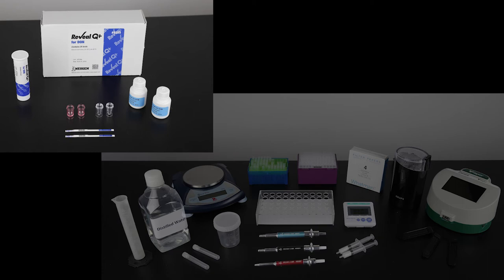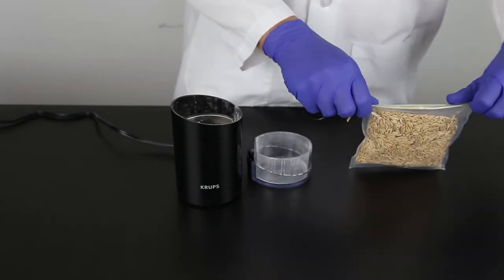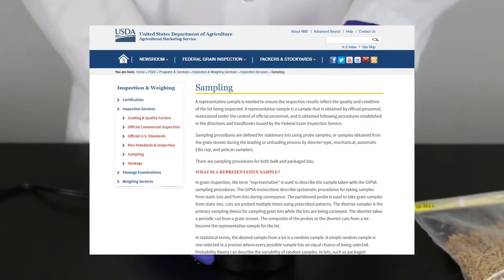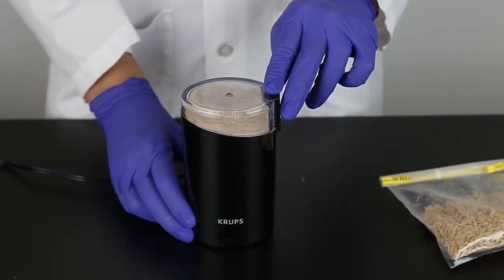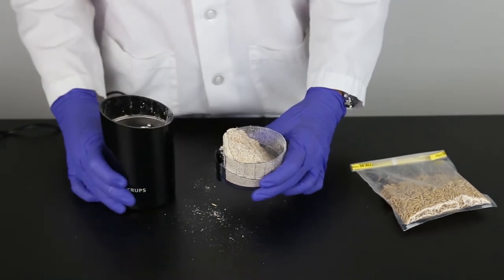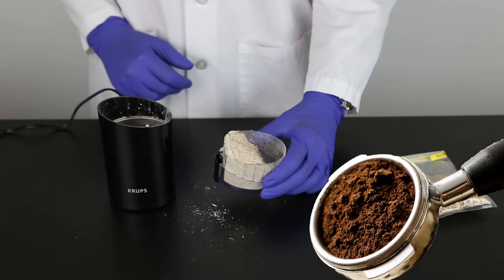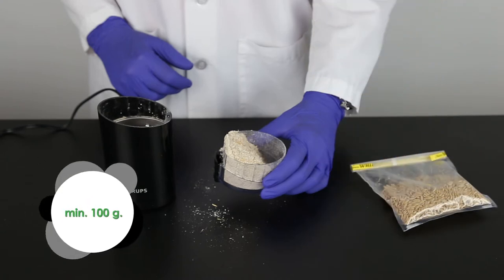To prepare the sample, begin by gathering all the materials required. The sample to be tested should be collected according to accepted sampling techniques. See the FGIS sampling protocol or contact your Neogen representative. Obtain a representative sample and grind so that at least 95% of the ground material passes through a 20 mesh sieve. The particle size should be about the same as espresso. It is best to grind a minimum of 100 grams of your sample.